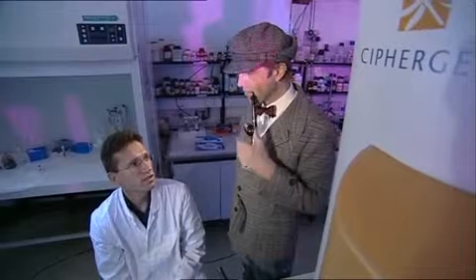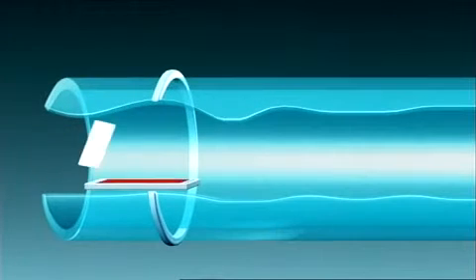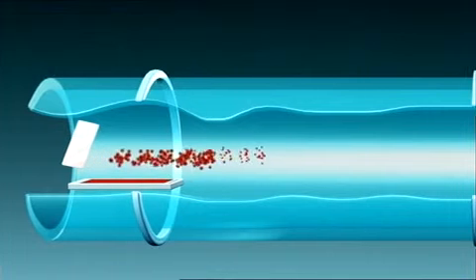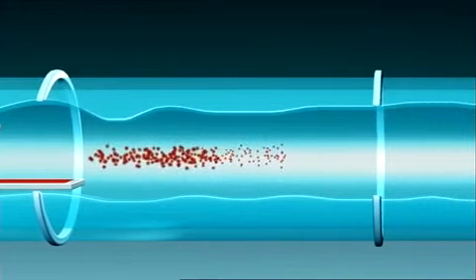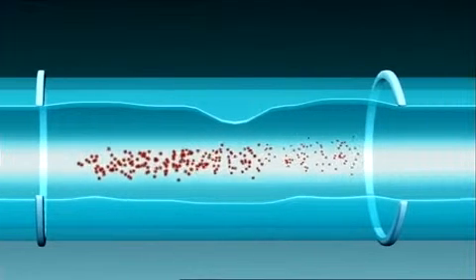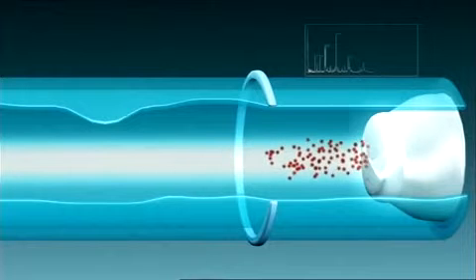By shooting a laser beam at the sample, the proteins are vaporized, ionized, and then accelerated within an electric field. They fly towards a detector on top of the machine, where the time of flight is measured. This happens very rapidly, many thousand times. The charged molecules, now being in gas phase, are passed through an electric field, where they are accelerated. This process sorts the particles by their masses. By analyzing the time needed for traveling through this field, the respective masses can be computed.